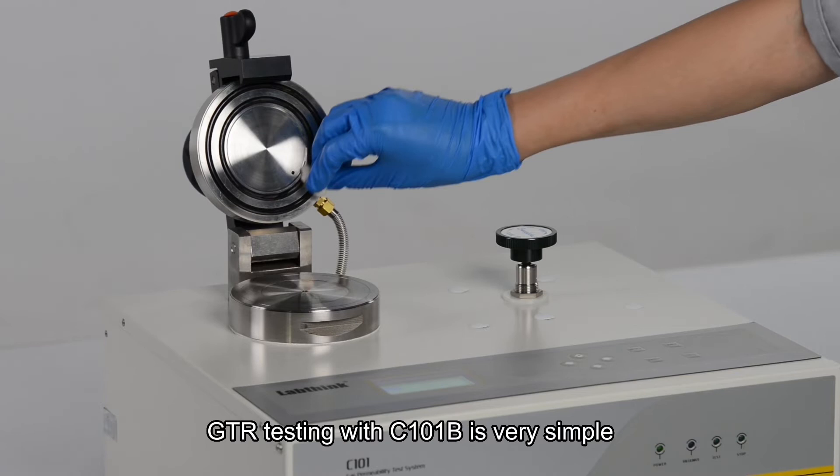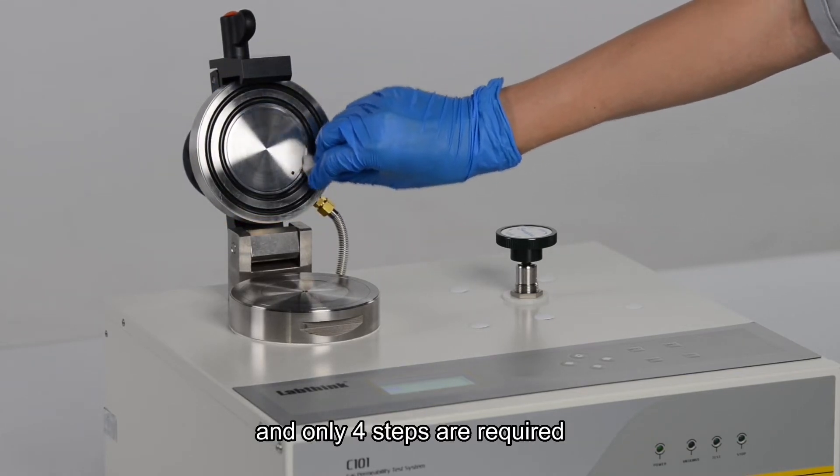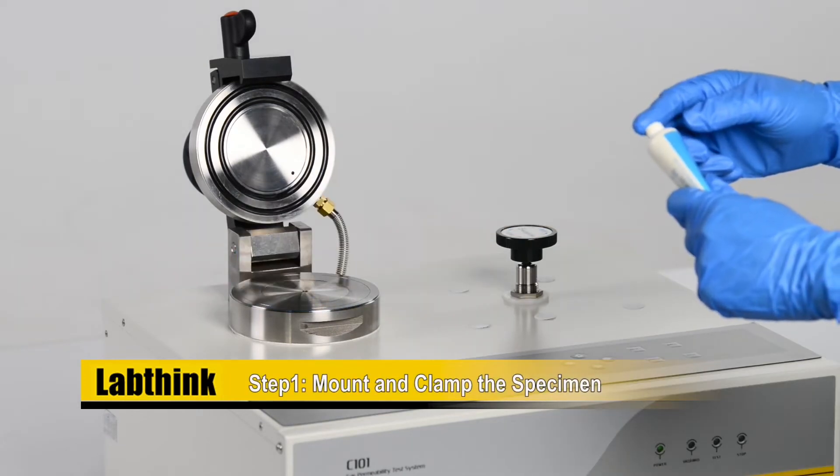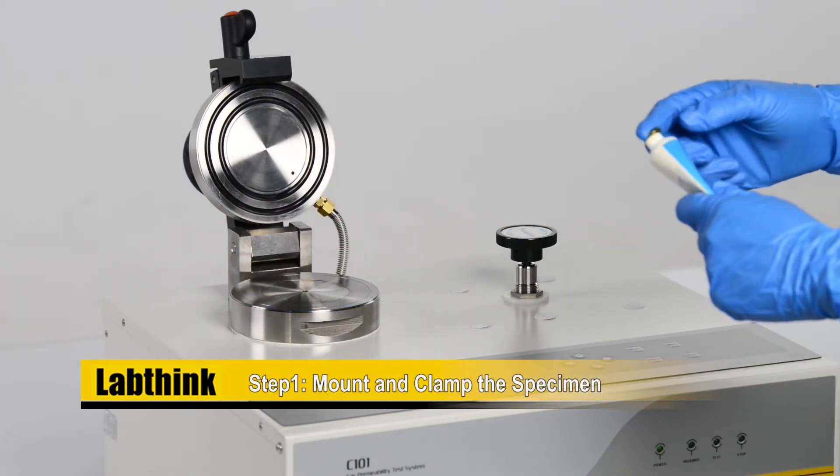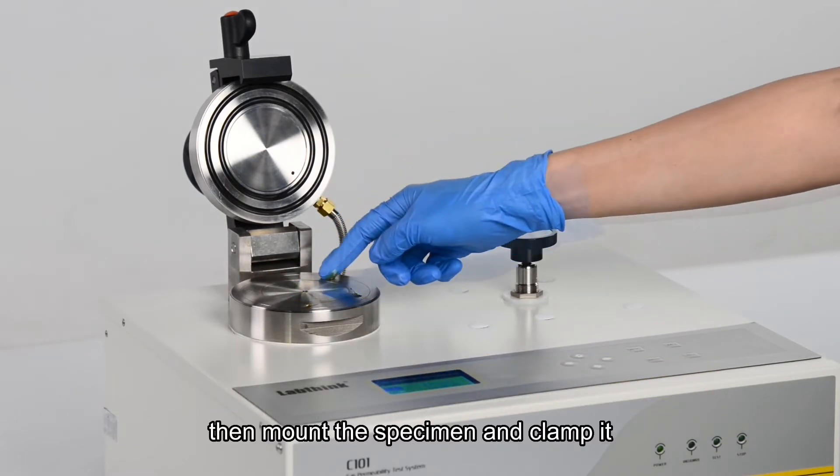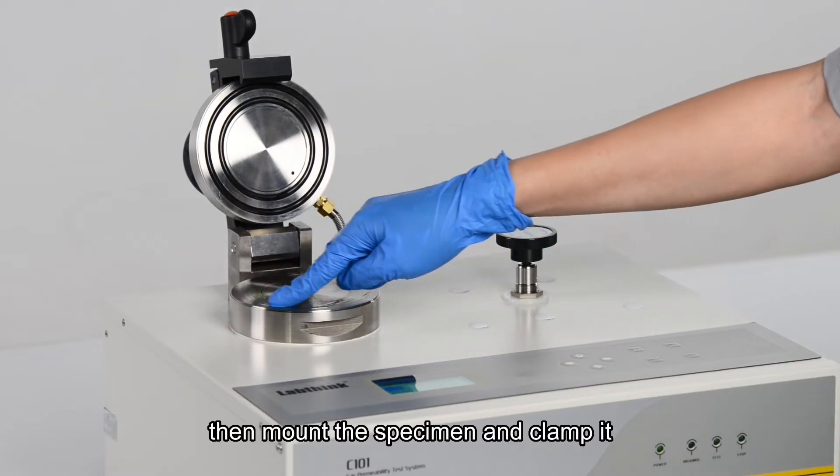GTR testing with C101B is very simple and only 4 steps are required. Step 1: Mount and clamp the specimen. First, we need to apply vacuum grease. Then mount the specimen and clamp it.